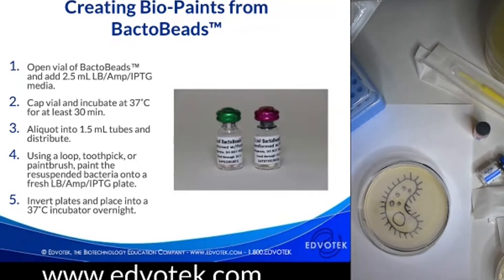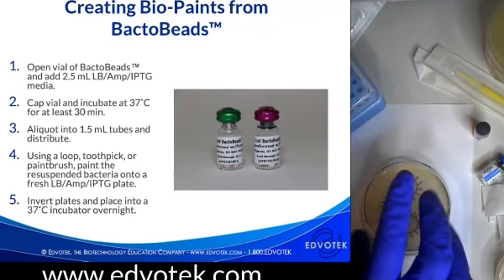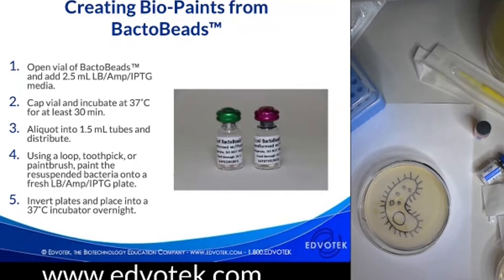I would let this sit here until all of the, especially the drops, soak into the media. So you probably want to let it sit here for 30 minutes before you put it in your incubator, let it go overnight to get the color to start. After the initial overnight incubation, I actually recommend throwing the plates in the refrigerator for about another 24 hours. At that point, I find that it helps the colors get really dark, really vivid, and then it will look great for your bio art.